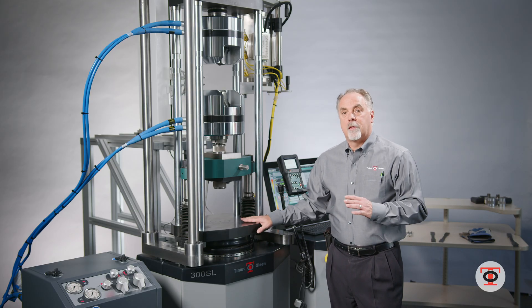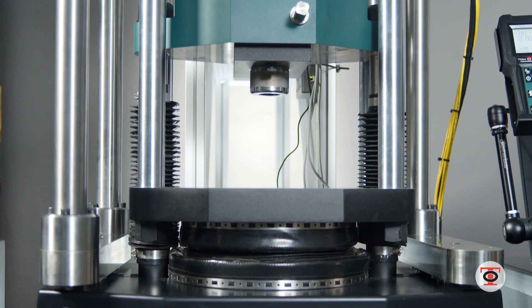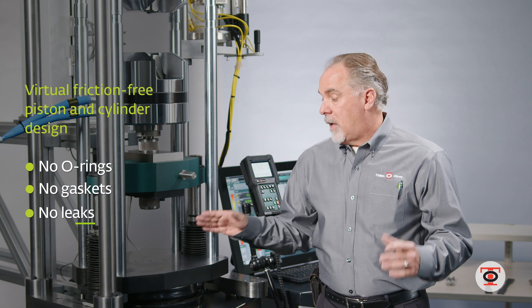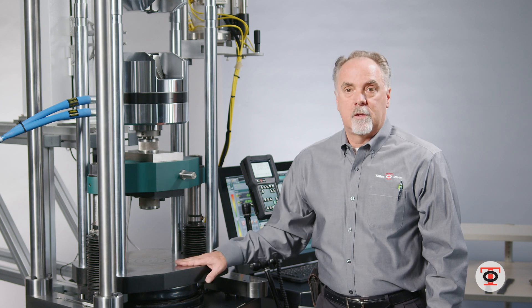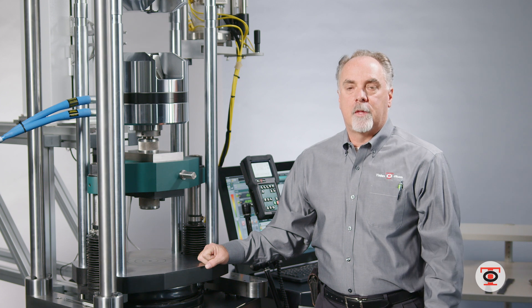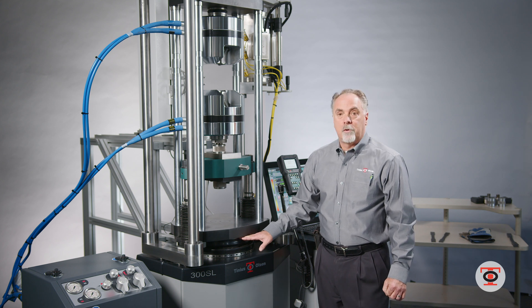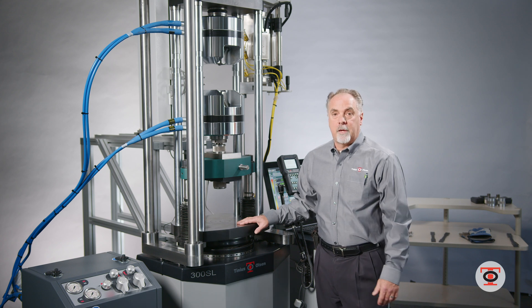What sets us apart from the competition is our piston and cylinder design. It's a virtually friction-free piston and cylinder with no o-rings, no gaskets, no leaks, and it will stand up time and time again — 60,000 pounds, you're breaking something, it's meant to take that fatigue. The competition uses load cells which typically fit under this table and will over time fatigue and need to be replaced.